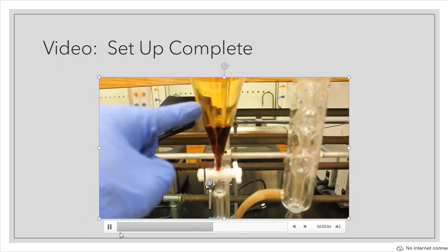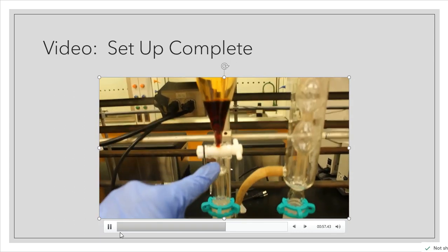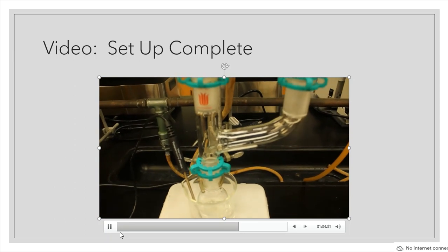a separatory funnel that is placed at that position. And that separatory funnel is holding my bromine addition. I'm going to slowly drip, drip, drip this directly into the boiling flask that sits below. And I'm going to heat it up at 50 degrees.